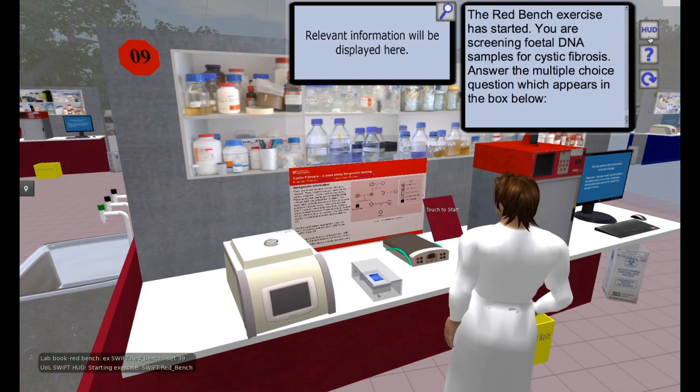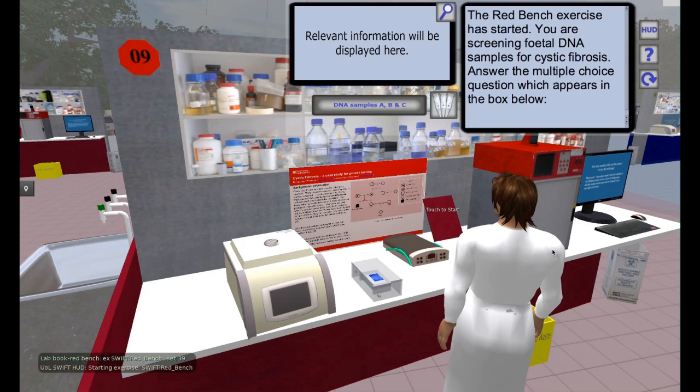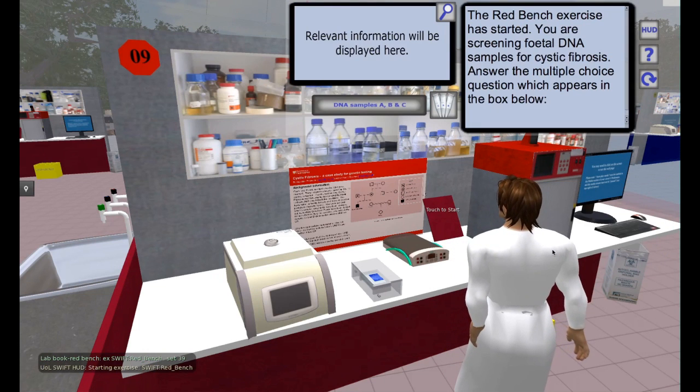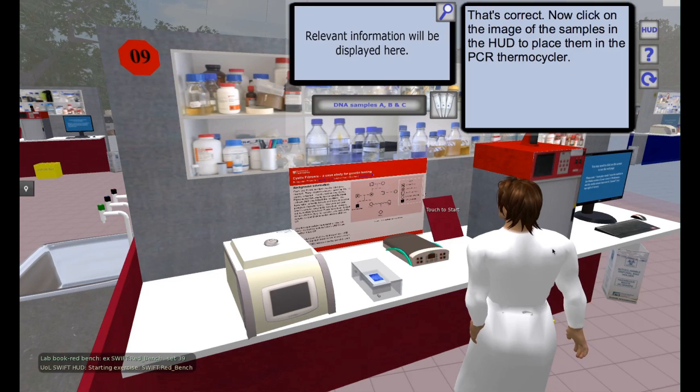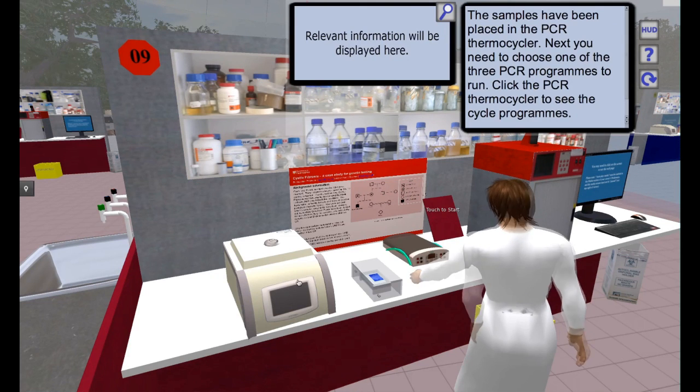This display guides them, like a personal tutor. Each step represents actions they've seen in the real labs. For example, they click on the samples to place them in the machine. They click on the machine to start the process.